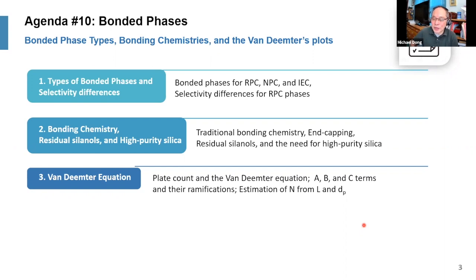For comparing separation power under gradient, you would have to use something called peak capacity. So plate count is a no-no unless you measure it isocratically. It's a very common mistake, right? So next time you see other people reporting plate count under gradient conditions, please yell at them, say that you're wrong, okay?